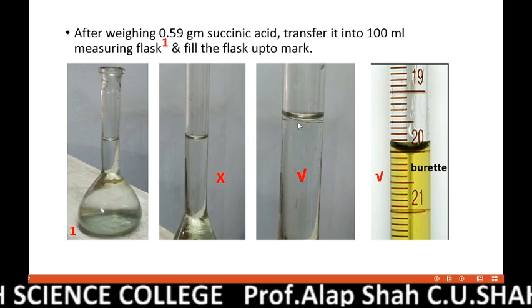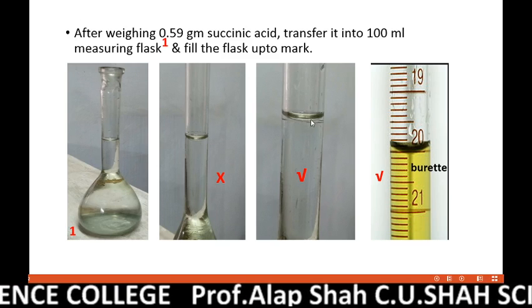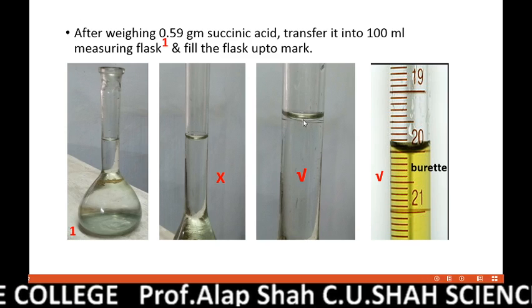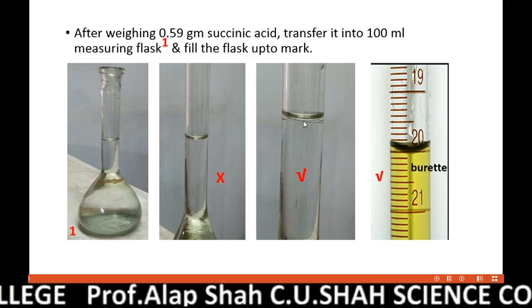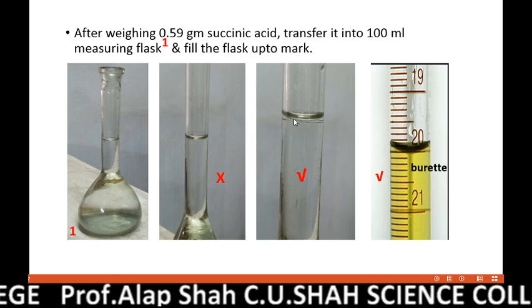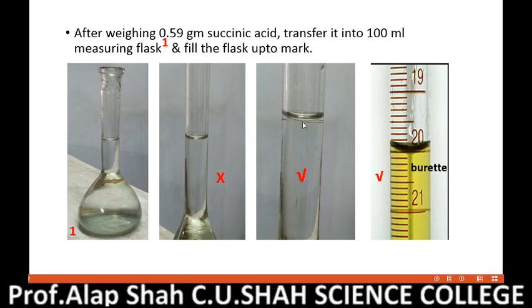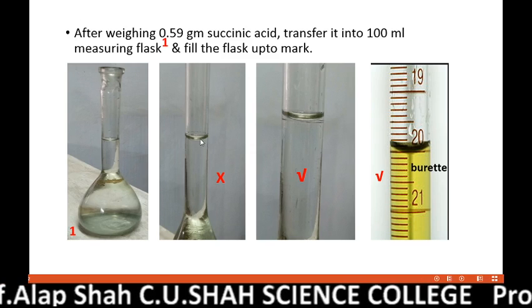On the contrary, this is the correct method. You can see the mark here; we have added slightly excess water in such a manner that the lower meniscus, meaning the lower surface of the water, touches this mark. So this is the correct method, and this is the wrong method.